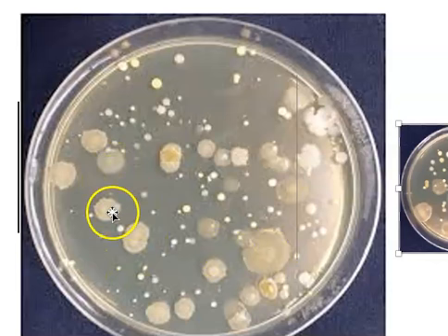Some of them have a central area that looks different from the rest of the colony. That's also a feature that we can see in some colonies. So I have to be prepared to, again, determine how many different types of colonies I see based on their features. And then report that I have at least that many organisms growing on the plate.